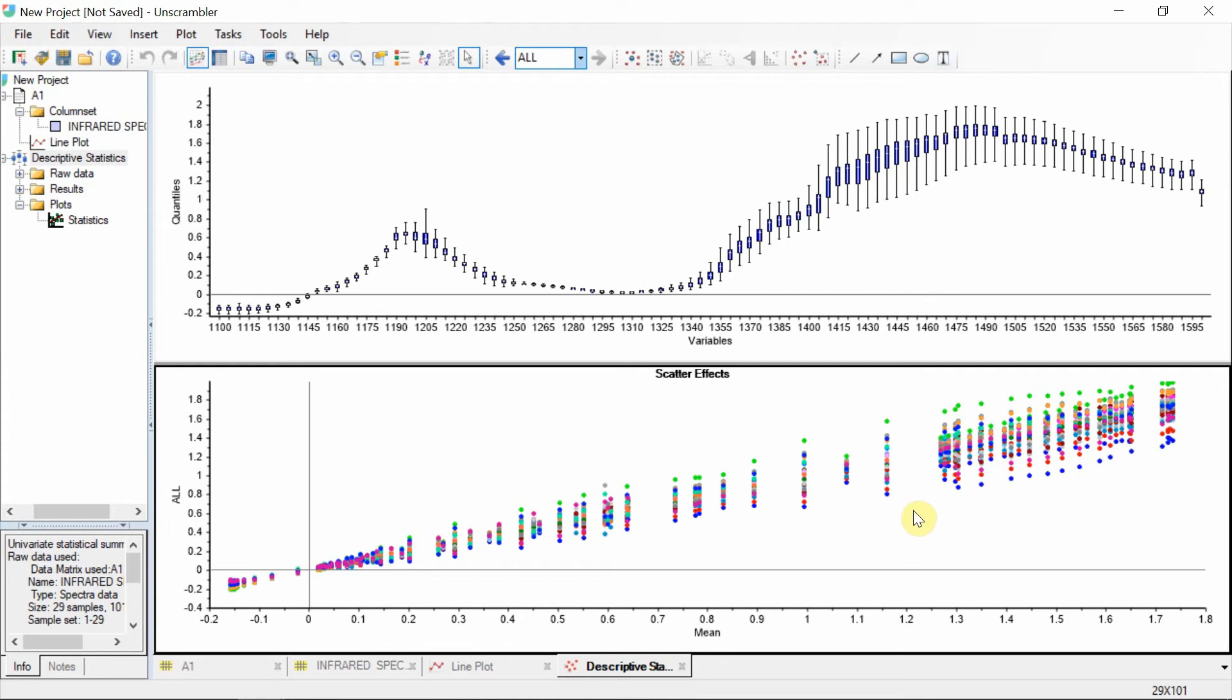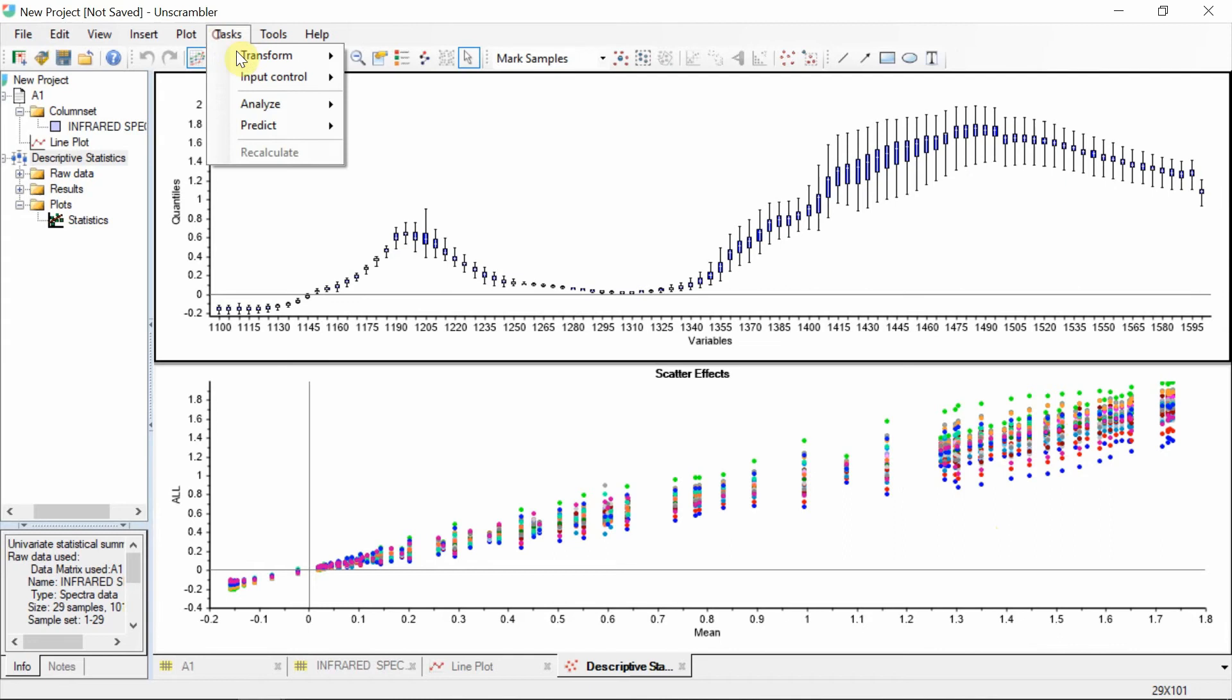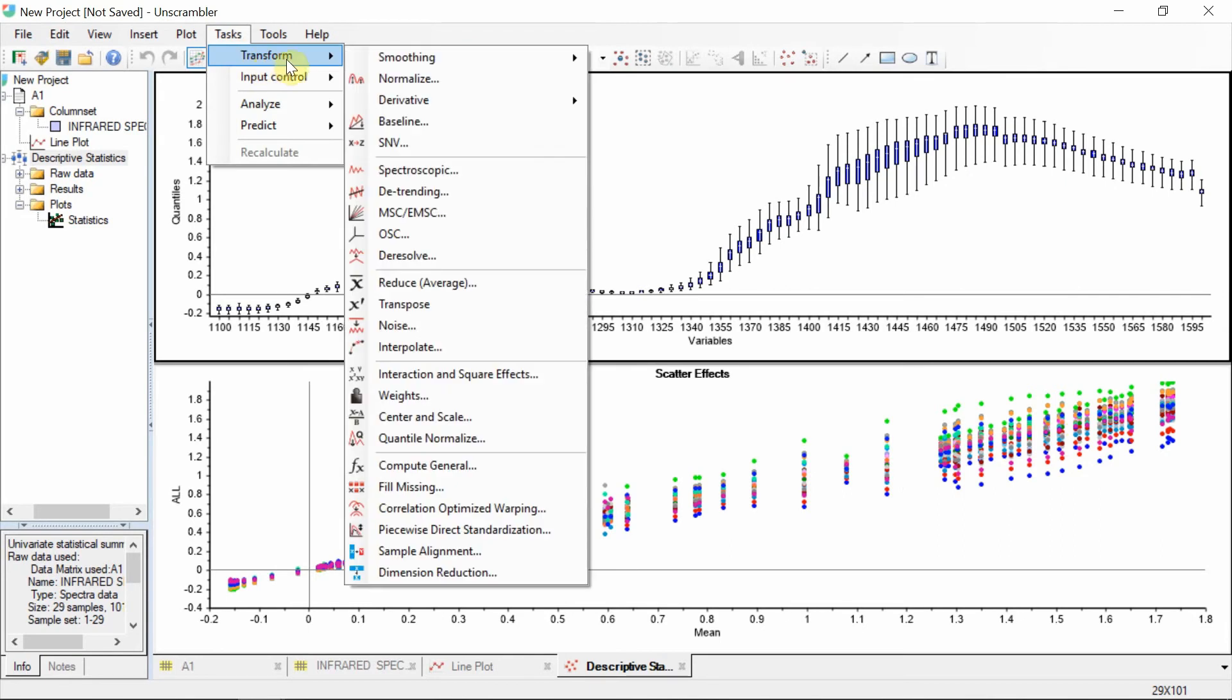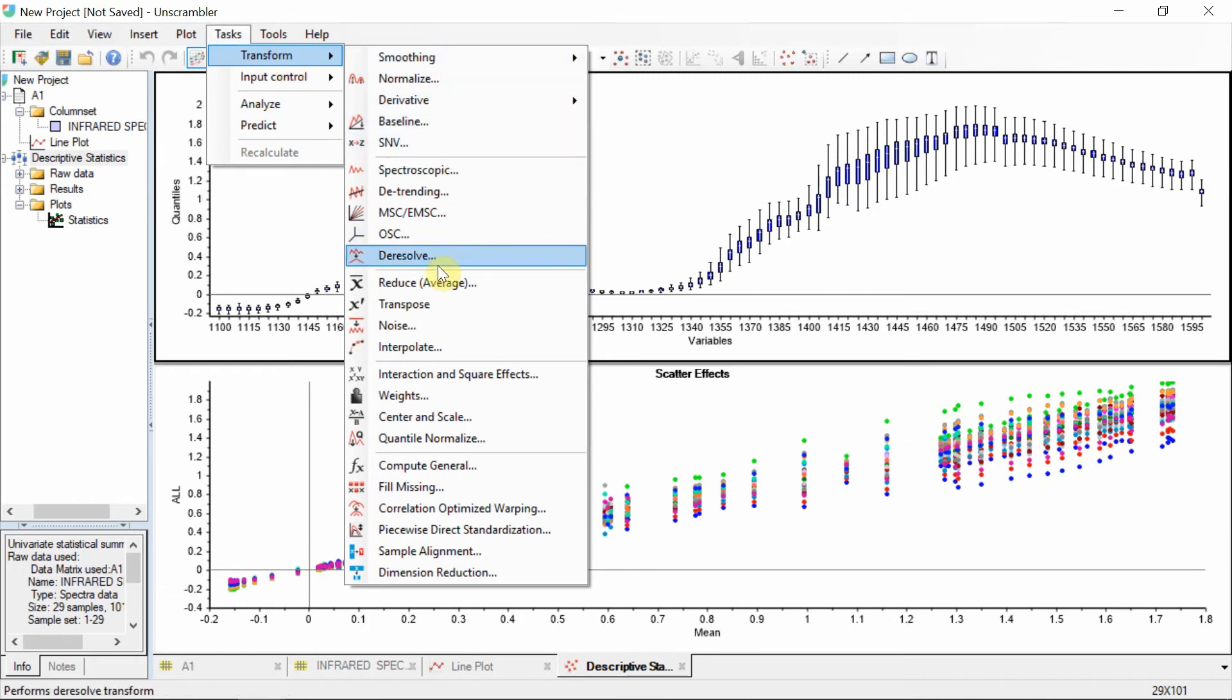We should remove this variation using transforms or preprocessing. The Transform menu offers a wide range of transformation options specific to various data types, including general and advanced spectroscopic preprocessing tools.